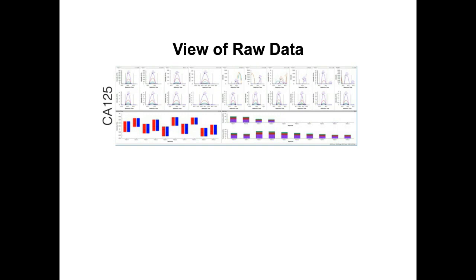What you can see is that the heavy spike-in is relatively constant. The light is detectable at diagnosis, goes down after surgery, goes further down, but then we can't pick it up anymore. So that suggests, a little bit disappointing, that CA125 PRM in its current condition is not as sensitive as an ELISA that has been optimized for 32 years. Maybe if one thinks about it, it's not completely surprising.